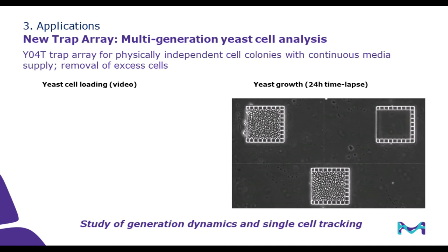Let's see the real trapping and culture in action. In the video on the left, it shows how loading is done. You see individual yeast cells gathering around the chambers and get randomly trapped in individual traps.